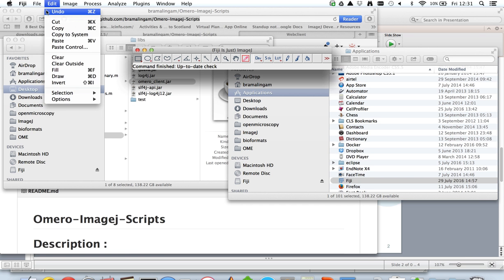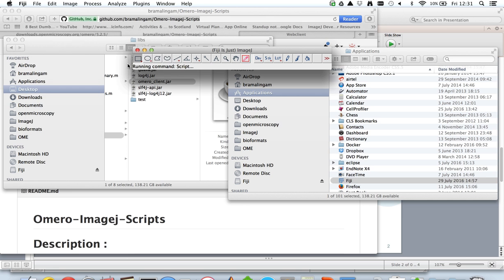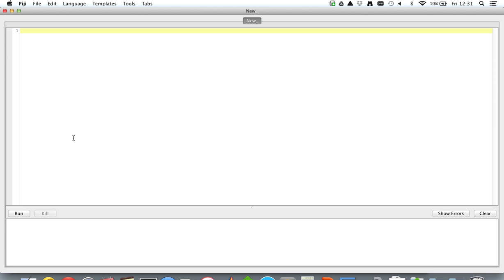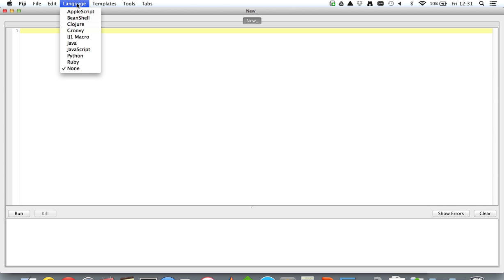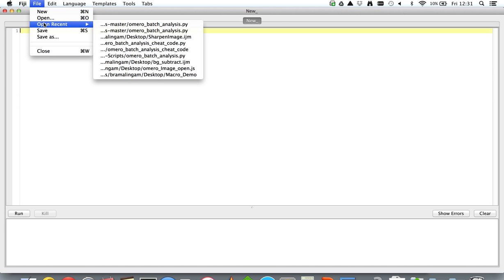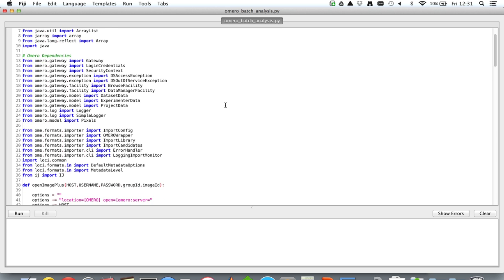Now opening up the scripting interface. This is the Fiji scripting interface and this allows scripting in multiple languages. For this demonstration what I'll be highlighting is the Jython scripting interface within Fiji. And this is the example script from the GitHub repository that I'd shown earlier.